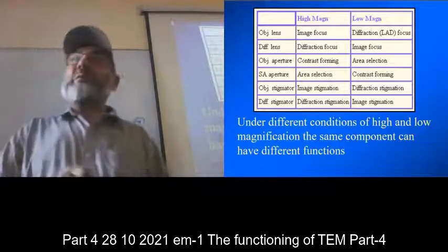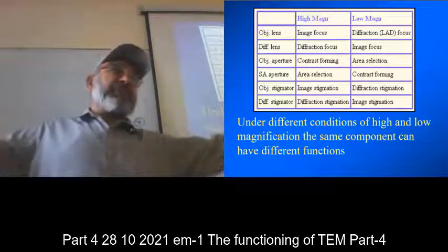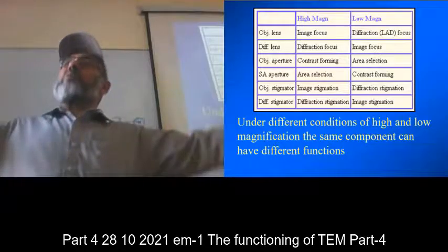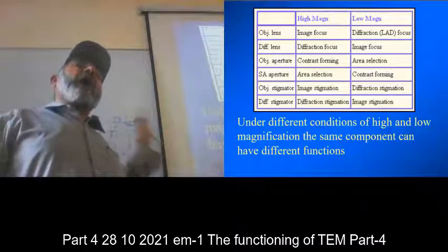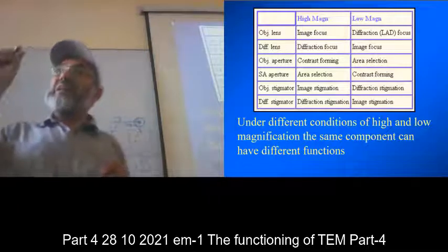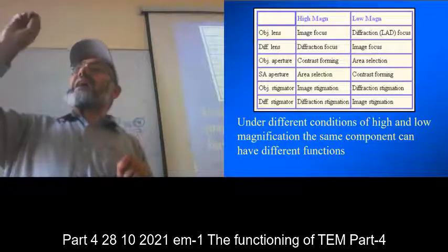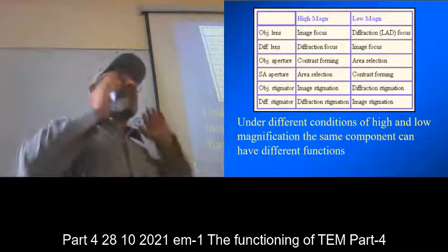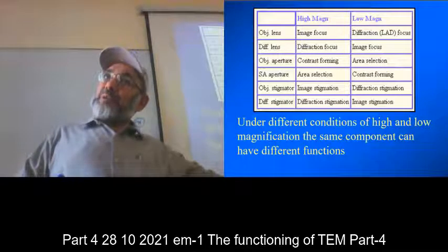And for that purpose, you turn the knob in both directions so that the coil, which is the lens which focuses the diffraction pattern, is brought to the optimum position so that the spots are completely spherical, and secondly they are visible, and thirdly they are not so bright as to burn the screen of the microscope.